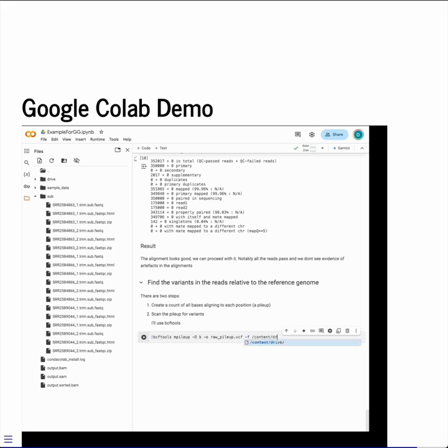It needs to know the path to the reference genome, so it knows what the reference allele, reference bases are. So I'll enter here. And here we provide our sorted BAM file from the last step of our alignment to run on. That shouldn't take long.